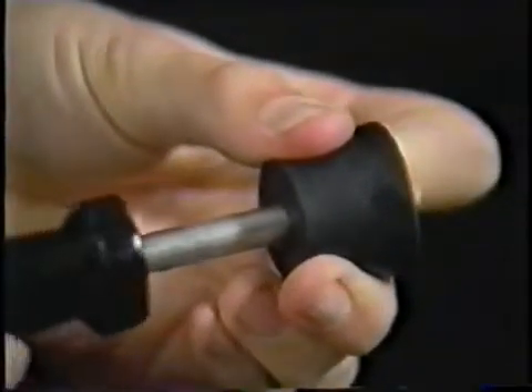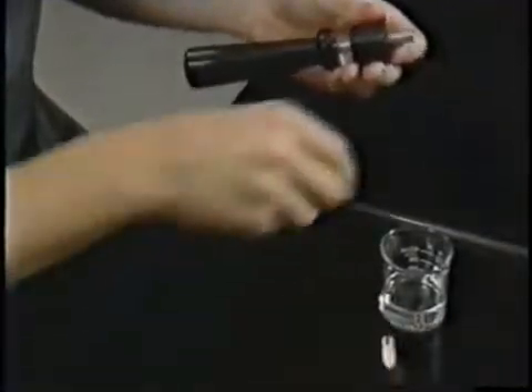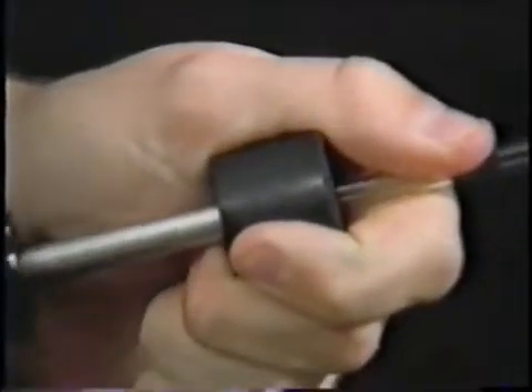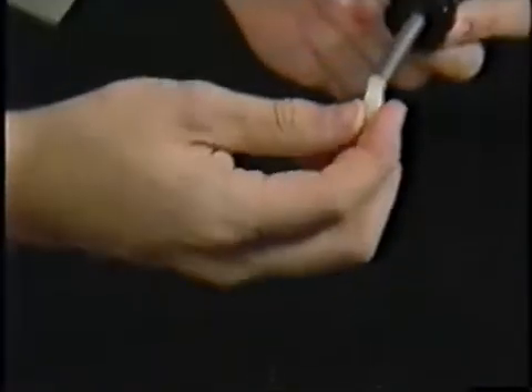Remove the tip and slide the tubing through the hollow inserter shaft. Removing the shaft leaves the tubing behind. Make sure to wash the lubricant off the tubing and stopper before using them, and replace the Teflon tip so it doesn't get lost.